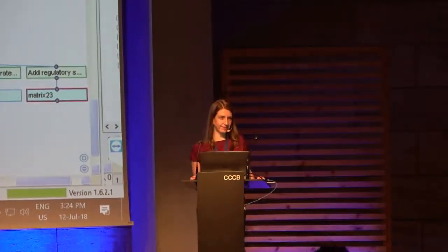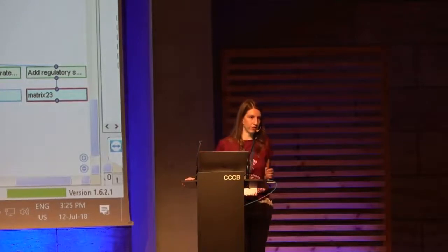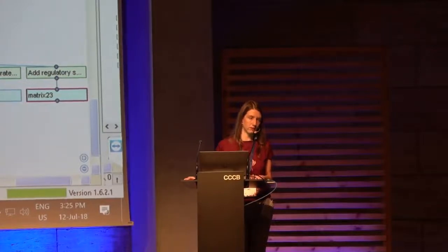So where do you define that this underscore that you were talking about is the multiplicity of the phosphorylation? And could you define it as underscore 1, 2, and 3, for example, all monophosphorylated peptides but in different positions? Or is this taken into account? So this is the output of MaxQuant. It already comes as 1, 2, and 3. And you could have more than that. Okay. And it's actually 1, 2, or more than 2. So 3 is kind of the average of everything else. So every monophosphorylated peptide site in a different position is a different line. Yes. Okay, I see.